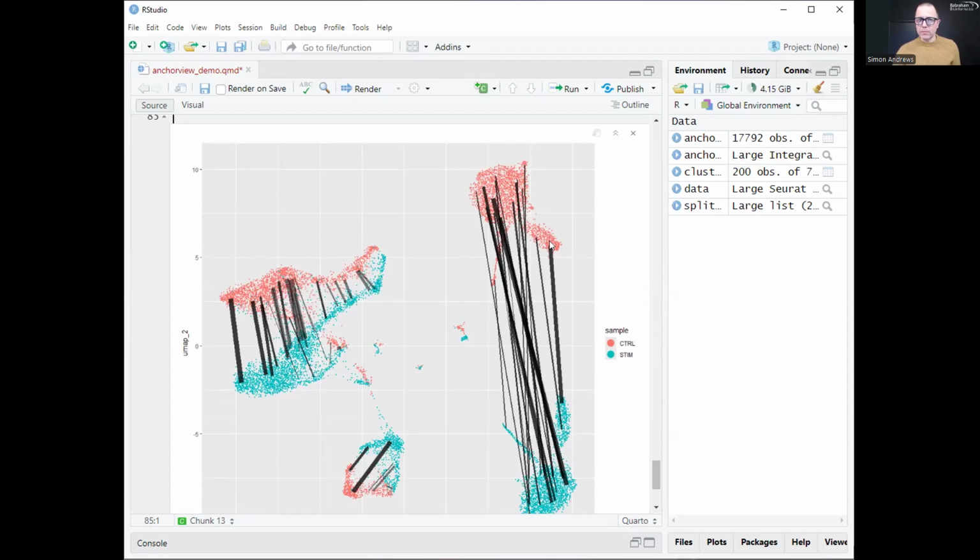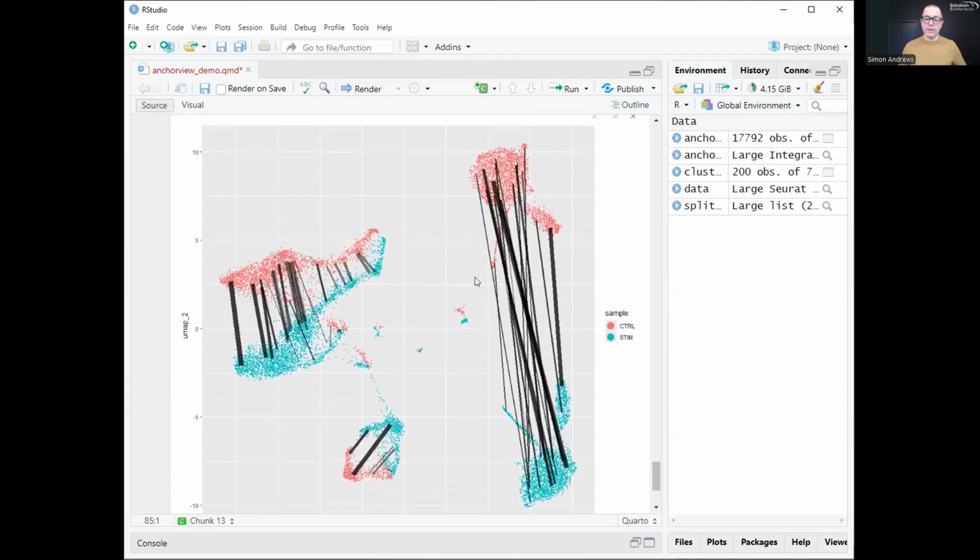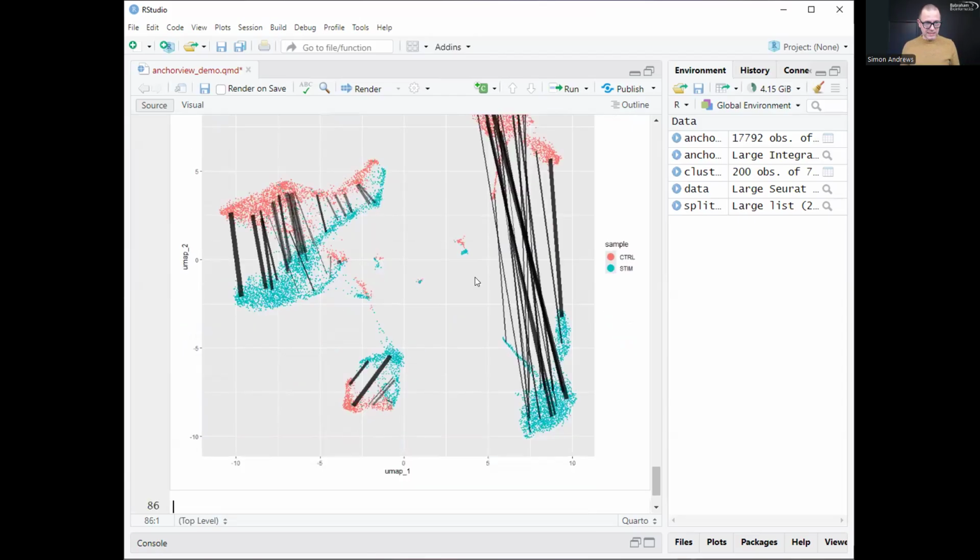Now, we are connecting at individual cell levels in here, and when we're clustering, we're just clustering arbitrary cells together. But another way which is really quite useful to think about the integration of data is to run the clustering of data individually for our split data set. So we have our control and our stimulated. So we can define clusters in both of those individually. Okay? And then we can start looking for connections between clusters in the different data sets.